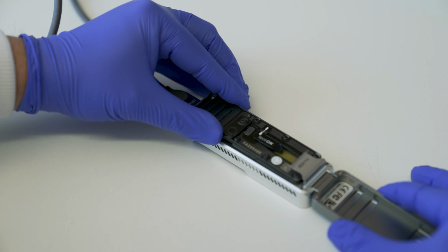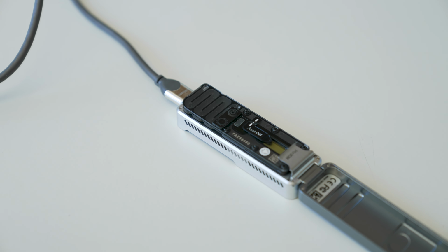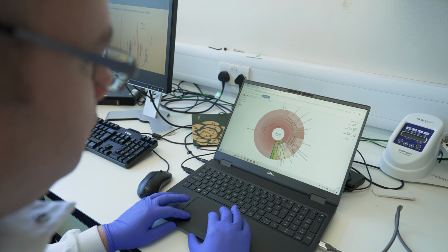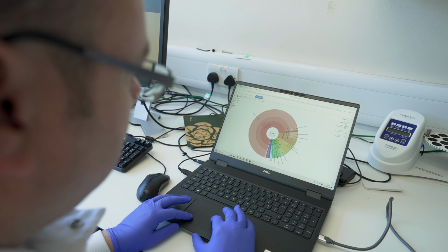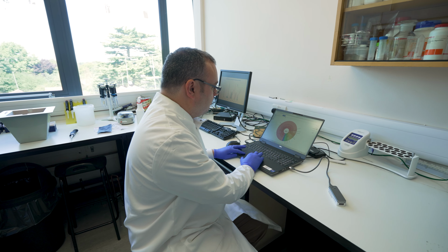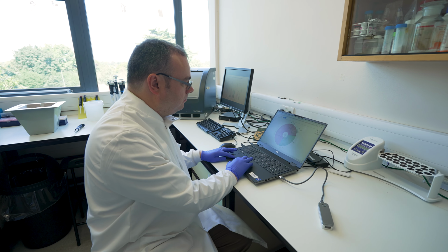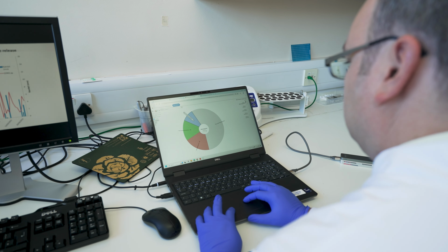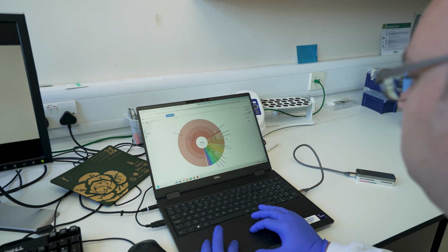Once we get our sample in, we extract the DNA from it and we amplify a particular region of the DNA called a barcoding gene. That barcoding gene differs between our different target species so that we can investigate which one is which. We then use that amplified DNA to prepare DNA libraries, and those DNA libraries we then sequence to investigate what species are present in that sample.